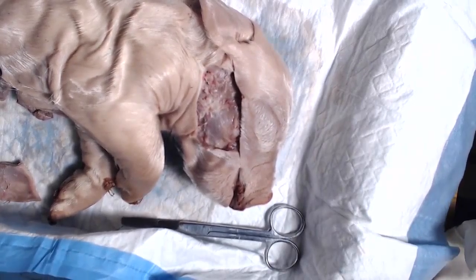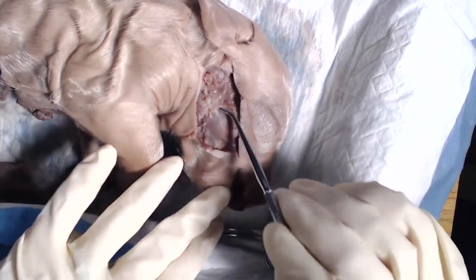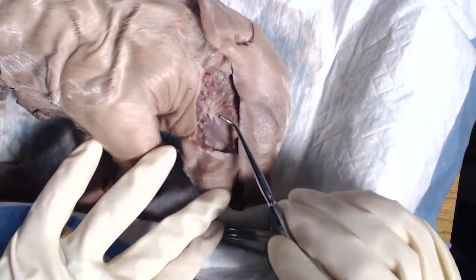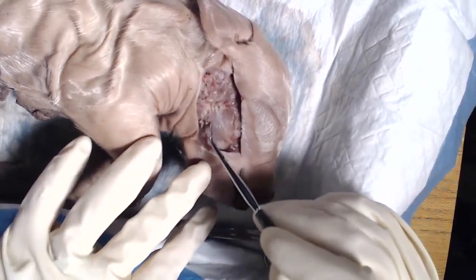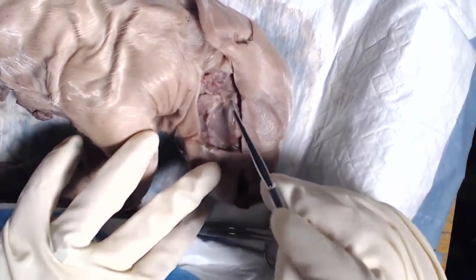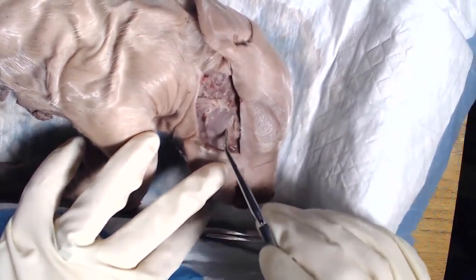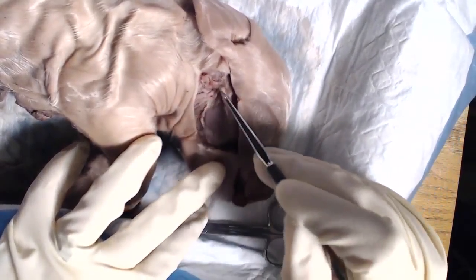All right, hopefully once you remove the skin, you should see a window like this with the skin removed. You can take your probe to identify the structures in this window. So first, let's get back to that. Let's take another look at the masseter. Take your probe and pull some of that tissue away that's covering that muscle.